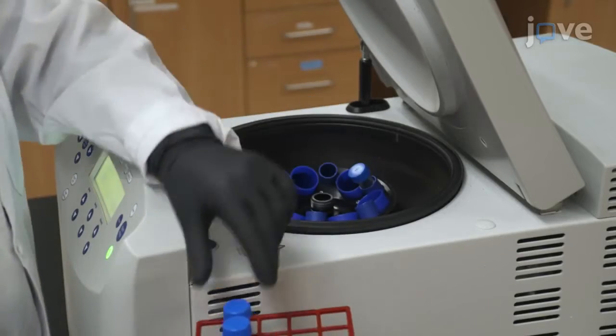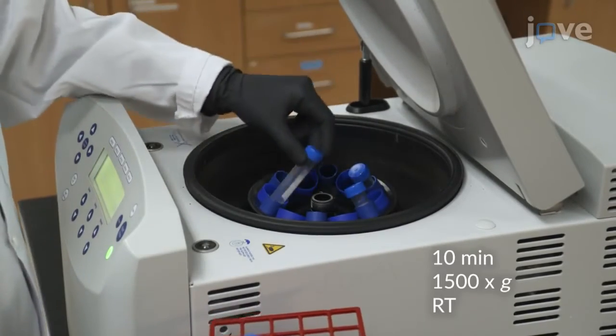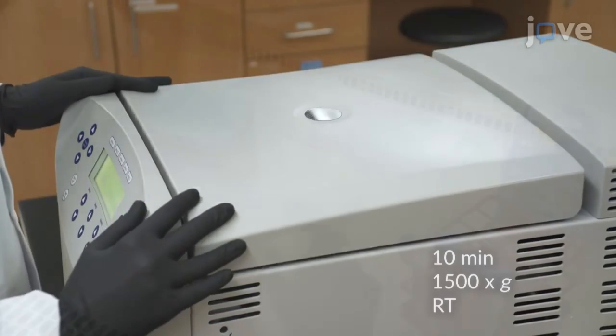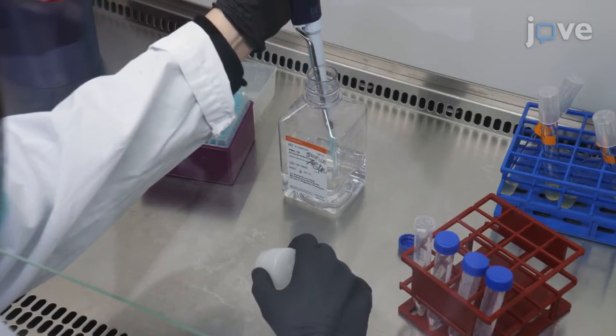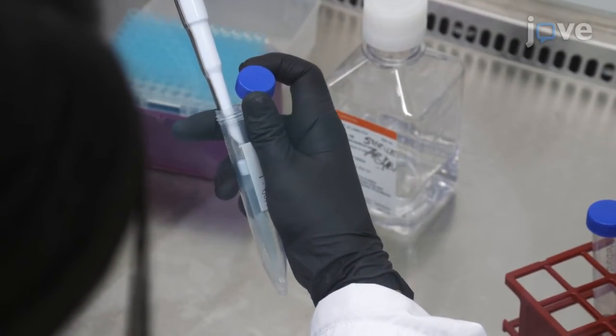To prepare fungal cells for a macrophage infection, collect and centrifuge C. neoformans cells from a mid-log phase culture, followed by 3 gentle washes with 1 milliliter of room temperature PBS under the same centrifuge conditions.